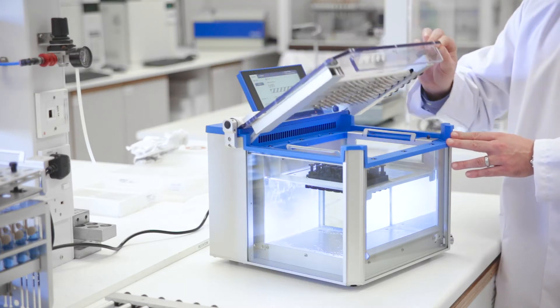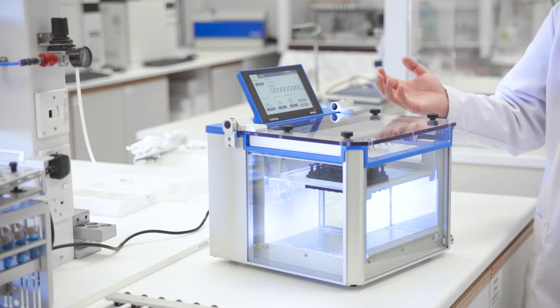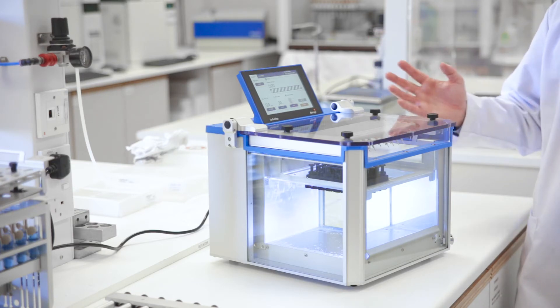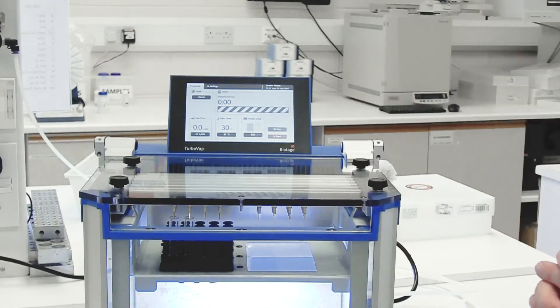We've now got streamlined processing. No more moving vials from one rack to another, no more possible errors, no more spillages of your sample. Just take the rack and put it straight into the platform.